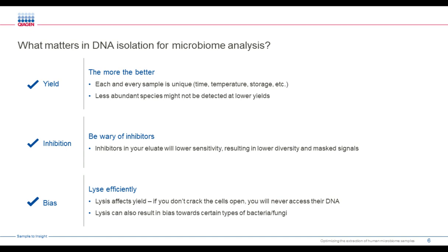The microbiome is made up of many highly diverse species with very diverse cell walls, and therefore also very different requirements for breaking them open. So depending on what you pick for your lysis, you can also bias your prep very strongly towards certain types of bacteria or fungus and miss other ones entirely. And we've found that this is really a critical point that we've spent some time on optimizing.